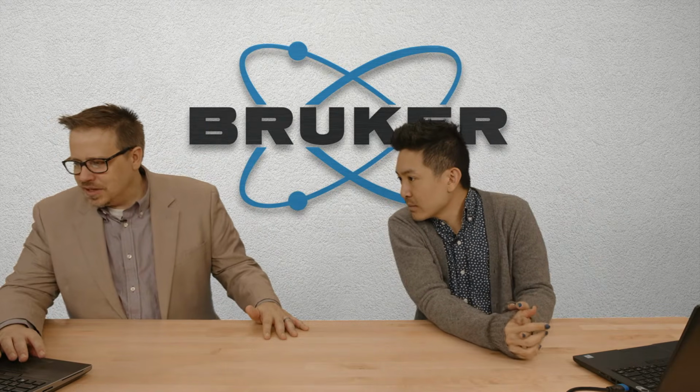How useful is the background tool? That's from Joseph. The background tool is interesting. One of the things people will be able to use the background tool for is modeling an amorphous background. If we're looking at crystalline versus amorphous, crystalline is very sharp peaks, amorphous is kind of that blob underneath it. You can use your background to fit that blob.